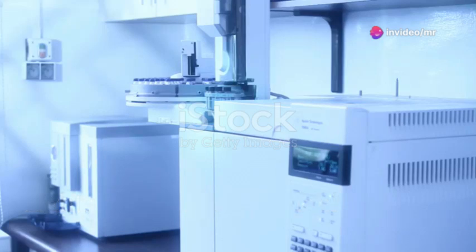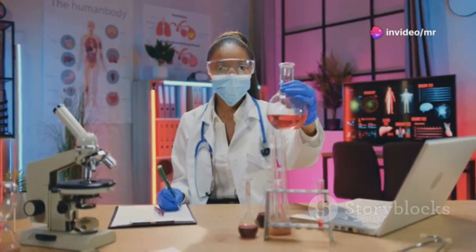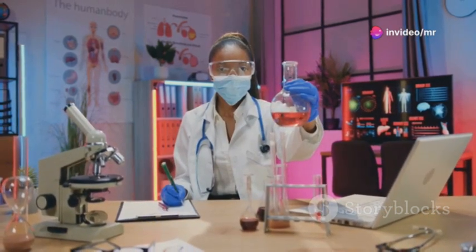Section 6: Lights, Camera, Diffraction, running the XRD experiment. Today, we dive into the fascinating world of X-ray diffraction, or XRD for short. This powerful technique allows us to peer into the atomic structure of materials, revealing their secrets.